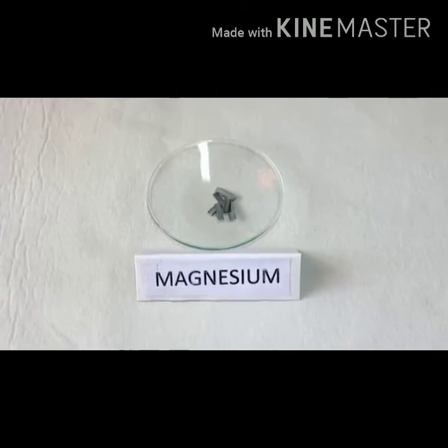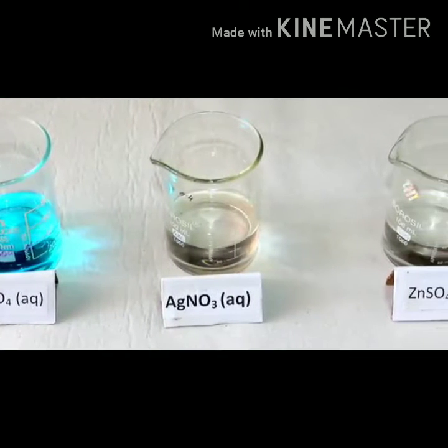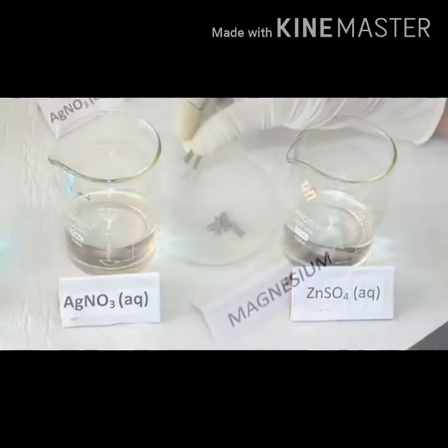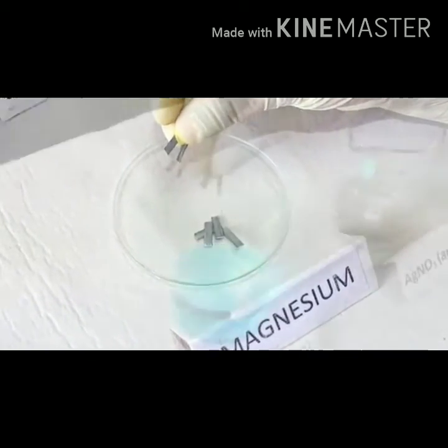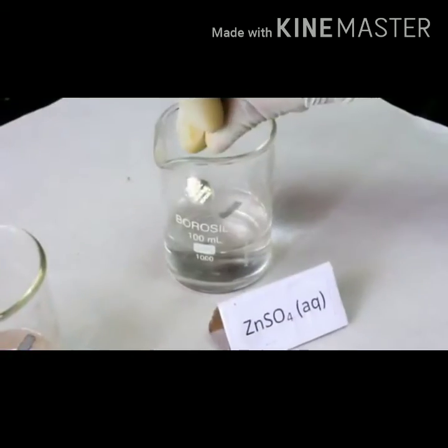To test the reactivity of magnesium in the solutions of copper sulfate, silver nitrate and zinc sulfate, add small pieces of magnesium into the beakers containing these solutions and leave them undisturbed for 1 day.